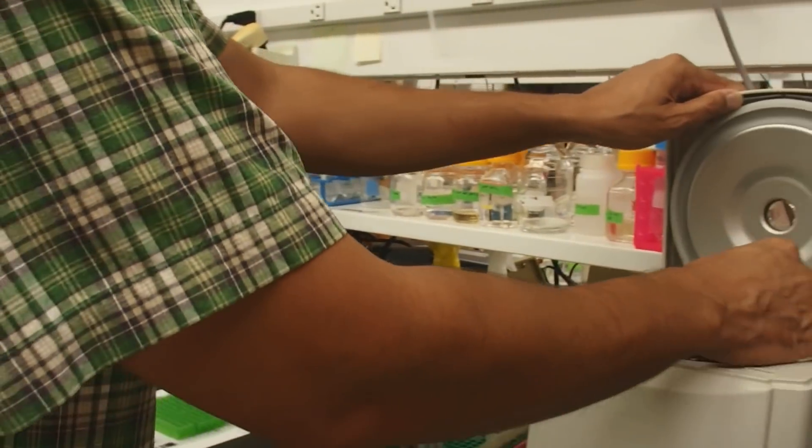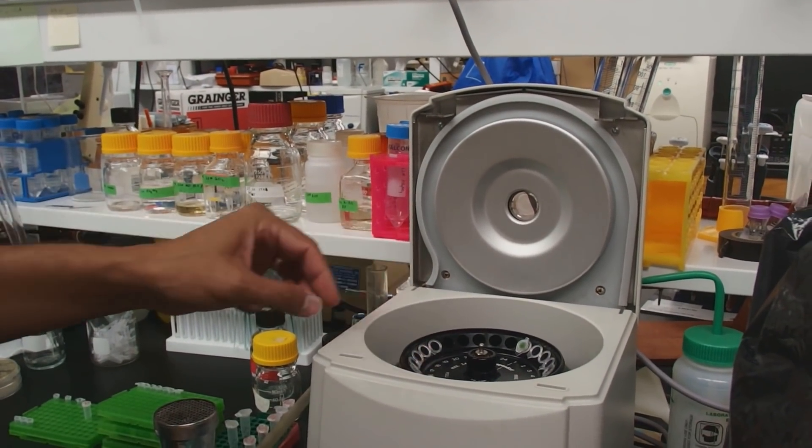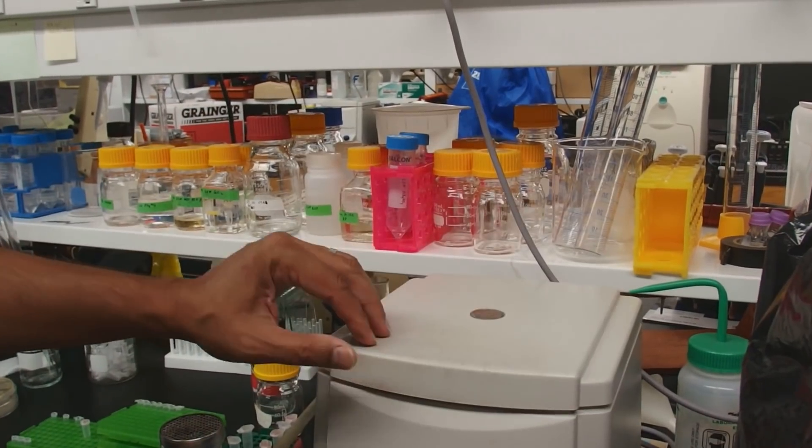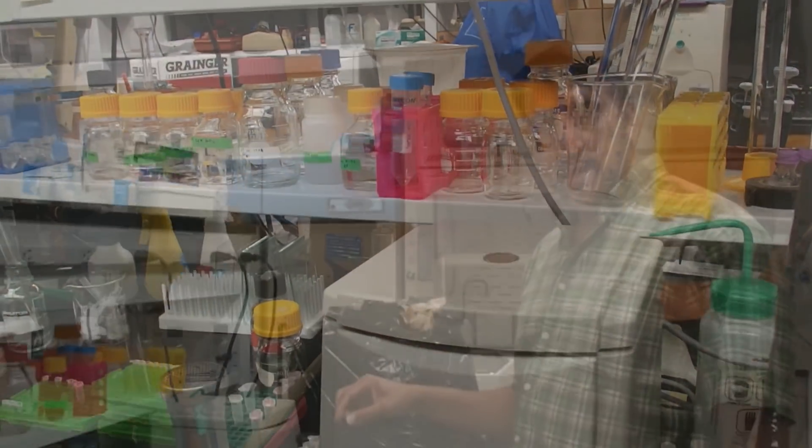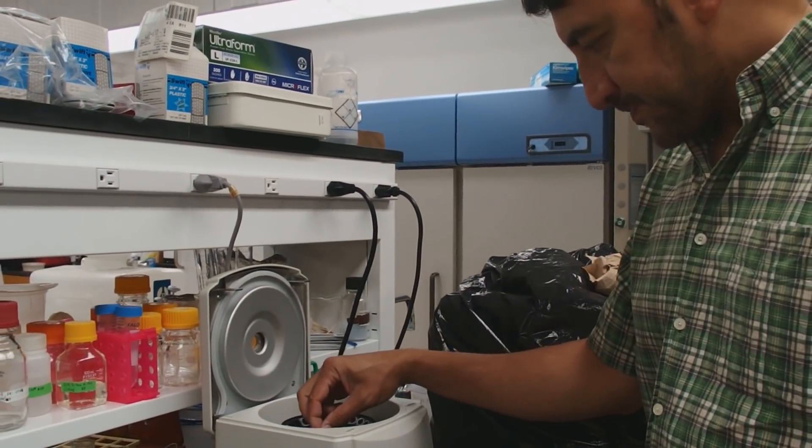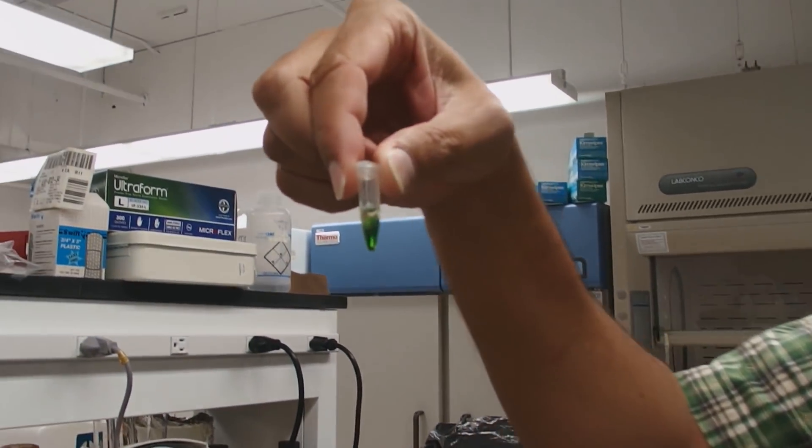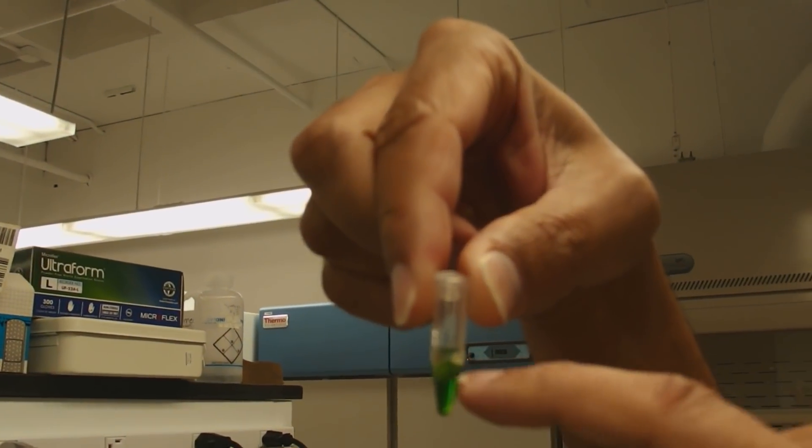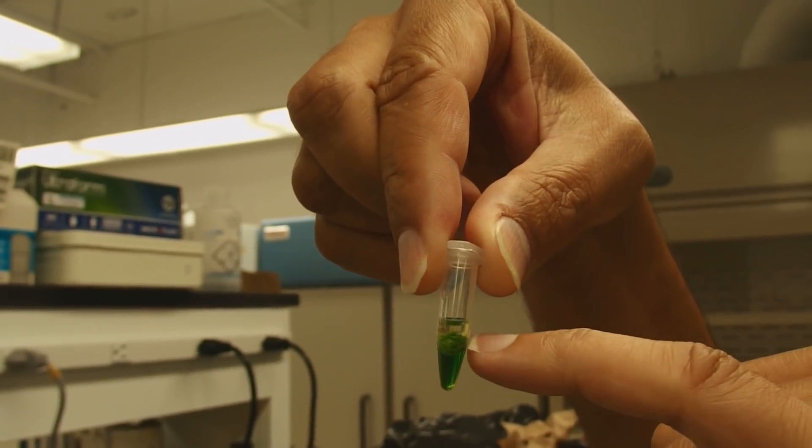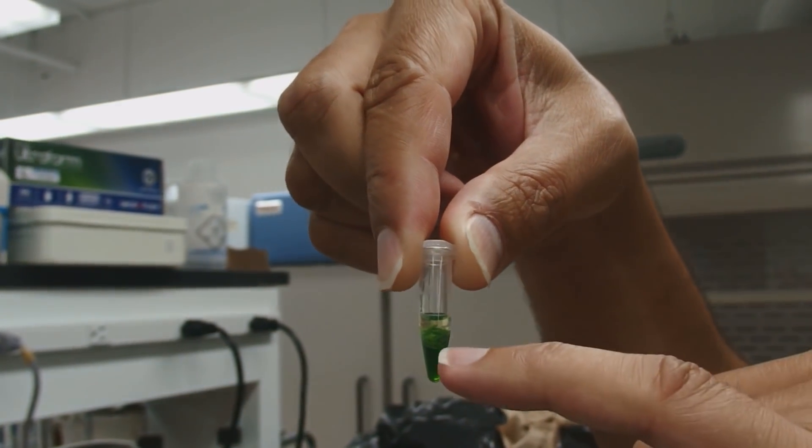Put it in our centrifuge. We're going to spin for one minute to separate the phases. All right, our spin is done. You can see that we've separated phases. On the bottom, we've got the green chlorophyll pigments and stuff in the chloroform phase. And then we have, at the interphase, we have a whole bunch of plant material, as you can see there.